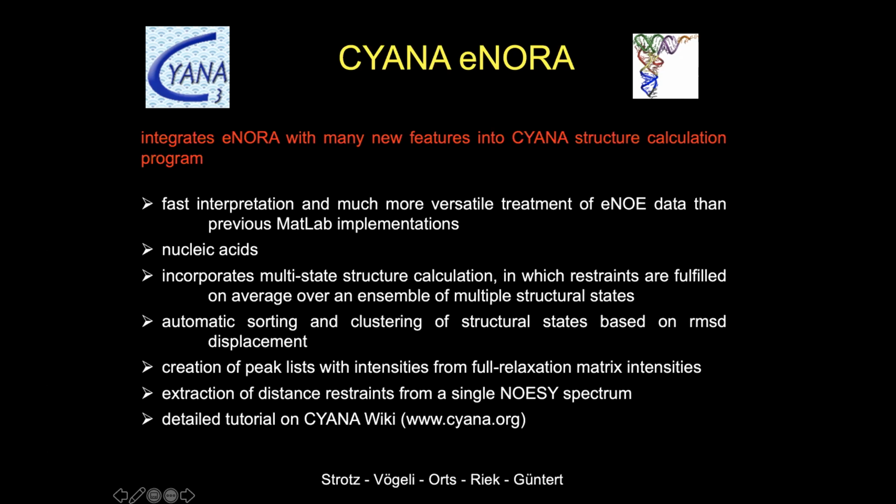Then we can also handle nucleic acids now, both RNA and DNA. We are currently dedicating a lot of time in exploring the possibilities here, but our first results are very promising.